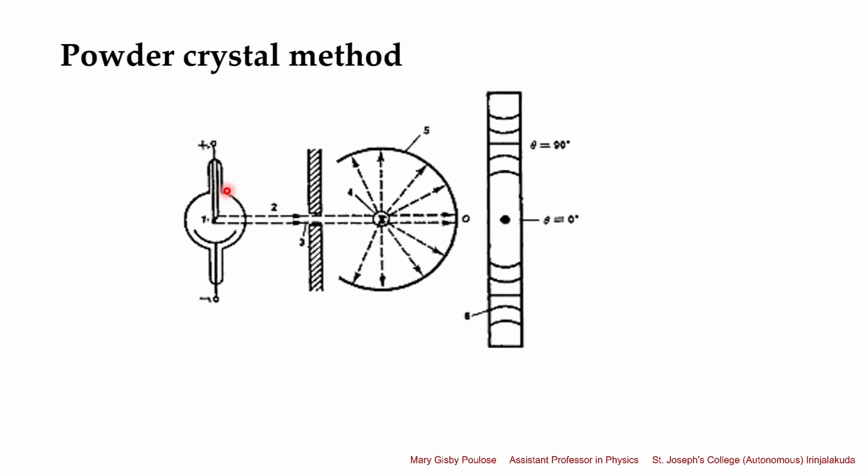So while we take the X-ray diffraction from that sample, while X-rays are falling on that crystal, at the same time we get peaks at different theta positions. Because the X-rays are falling on different atomic planes simultaneously, and different Bragg reflections are obtained at the same time. So at this point, in the diffraction of the X-ray, we get the spot due to this incident X-ray beam.